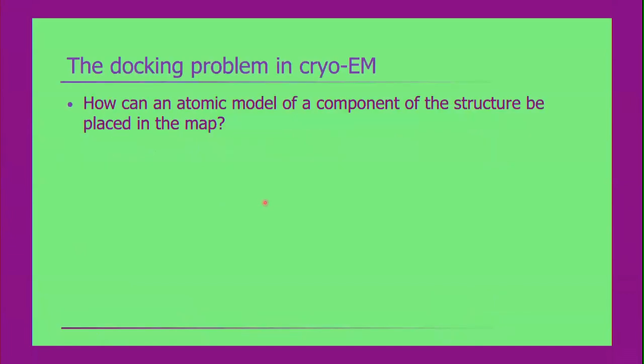Okay, so just to clarify what I mean by docking, you probably all know, but I'll just make sure. It's basically figuring out how an atomic model can be rotated and translated to place it into the right place in the map that you've reconstructed.